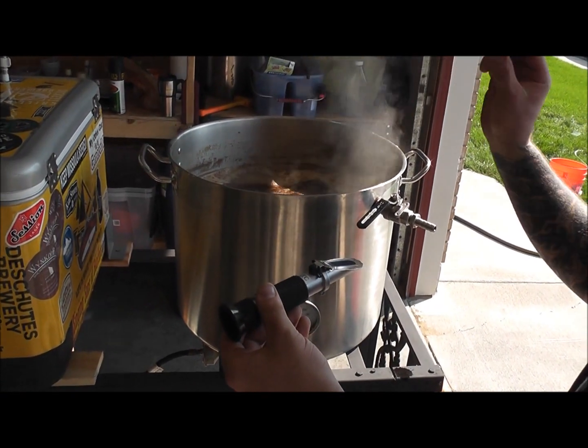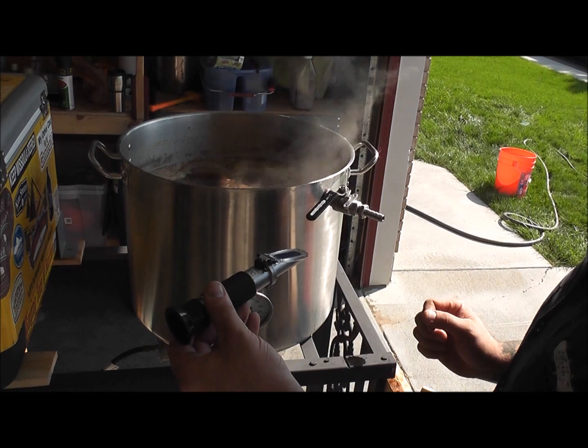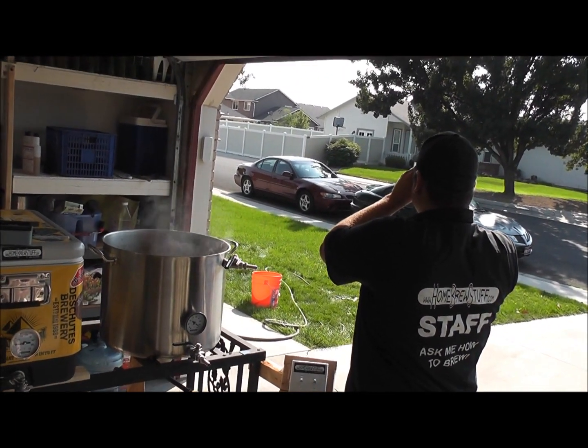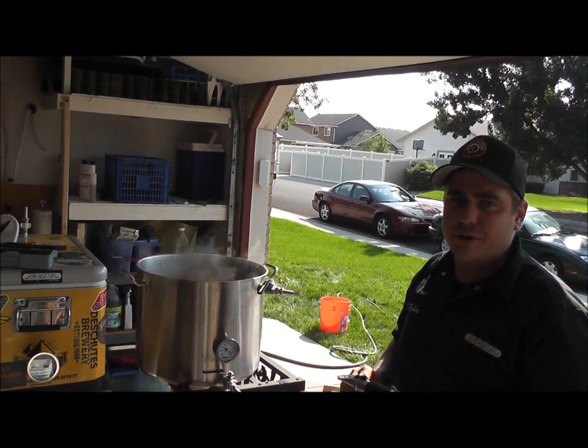Mind you, this only works for original gravity. You cannot take a final gravity with this measurement device. 1.075 — pretty good for a Russian Imperial.